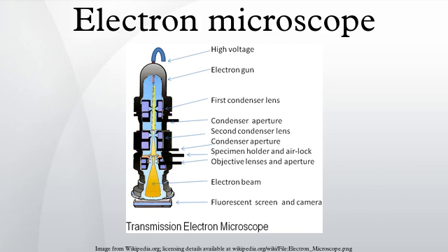Sample preparation. Materials to be viewed under an electron microscope may require processing to produce a suitable sample. The technique required varies depending on the specimen and the analysis required. Chemical fixation for biological specimens aims to stabilize the specimen's mobile macromolecular structure by chemical cross-linking of proteins with aldehydes such as formaldehyde and glutaraldehyde, and lipids with osmium tetroxide.